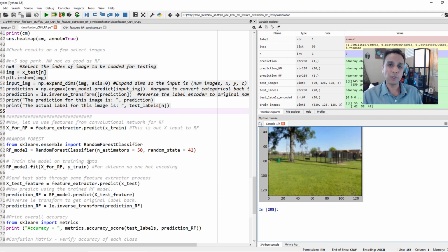This can be a very useful approach. In the past, I used this approach to classify texture of a whole bunch of minerals, so there were a lot of light microscopy images of different minerals. The mineralogy is the same, but the texture is different between these different minerals. So I used a very similar approach to actually separate them into different classes. In that case, it was like 12 different classes or so, and it actually worked very, very well. So whether it is geology, material science, or life sciences, this can be a great approach for classification.